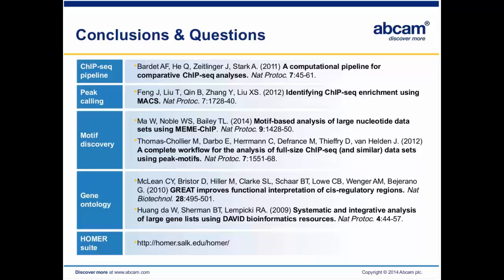It is highly recommended for wet lab biologists who are doing genomic experiments to learn some basics about Linux usage and perform the data analysis yourself. It makes you have a better understanding of the data itself. And once you've done that, all the things we just went through in this webinar can be done in just several simple commands.